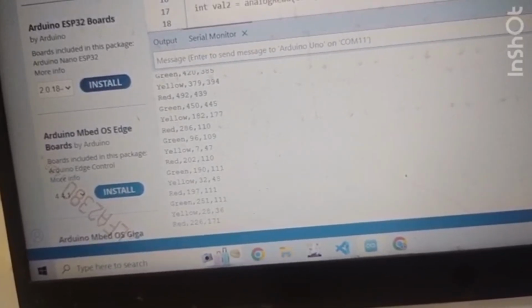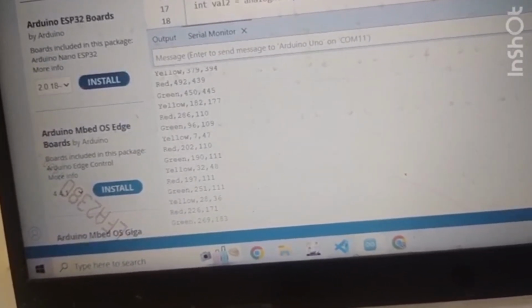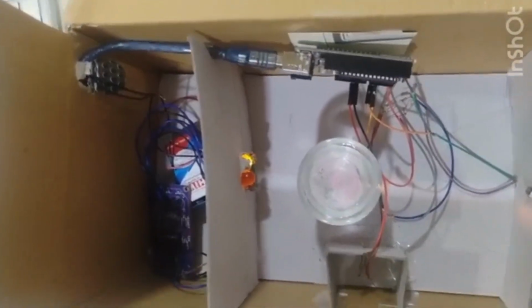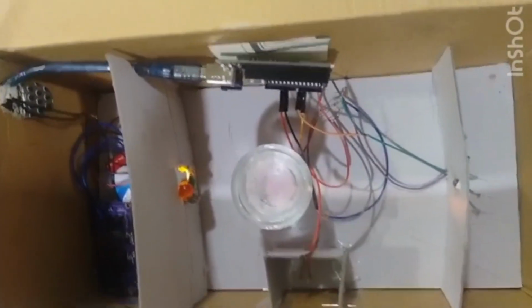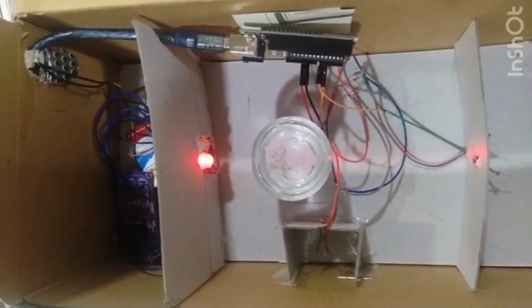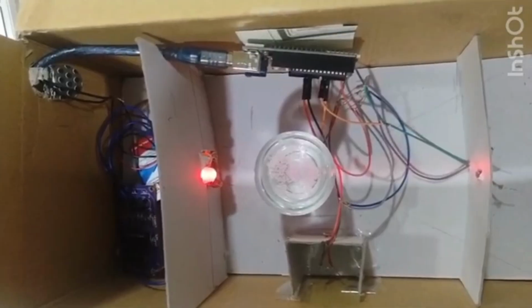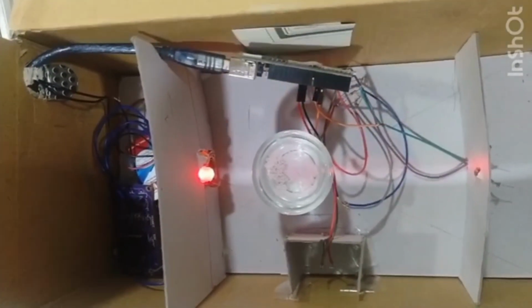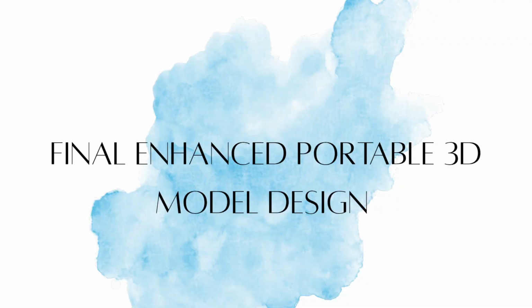This is our very first prototype. In future, we aim to implement the system using an ESP32 microcontroller, photodiodes for higher accuracy and sensitivity, and even a laser source instead of LEDs for greater accuracy. Our model is portable, cost effective, and provides real-time data, making it highly suitable for field application in microplastic detection.